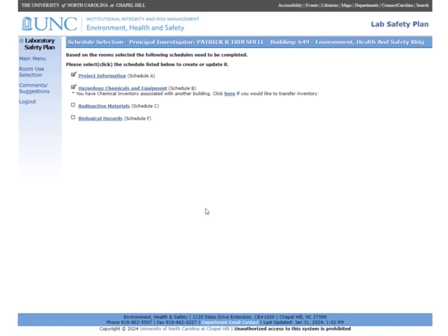We have finished editing the Schedule B portion of our lab safety plan. In the next training video, we will explore how to update and submit your chemical inventory.